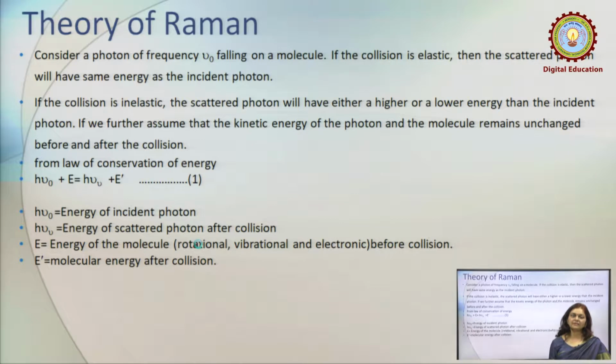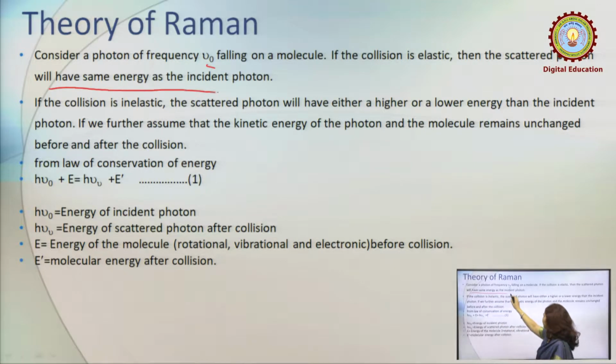Now, we will discuss in detail the theory or principle of Raman spectroscopy. Let us consider a photon of frequency nu naught falling on a molecule. If the collision is elastic, then the scattered photon will have the same energy as the incident photon.